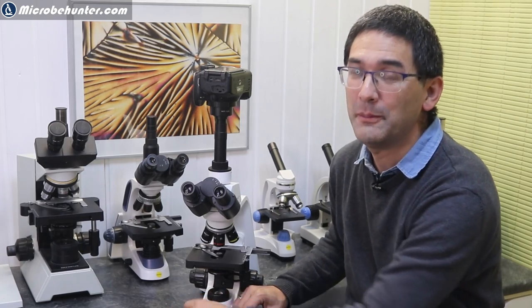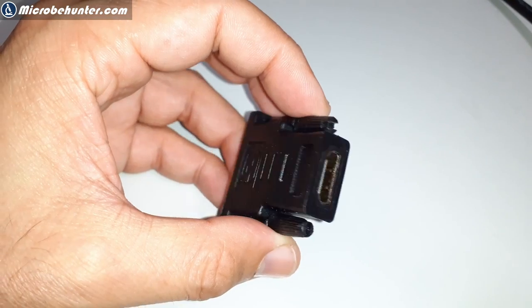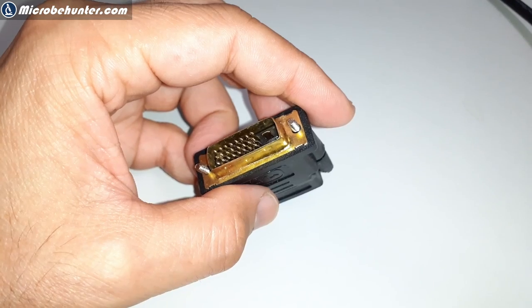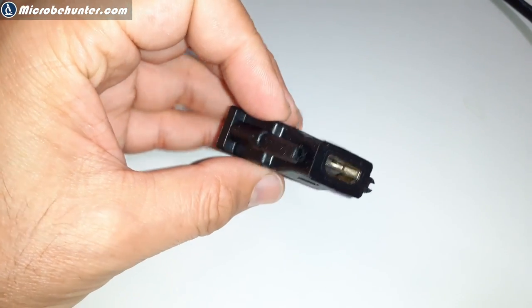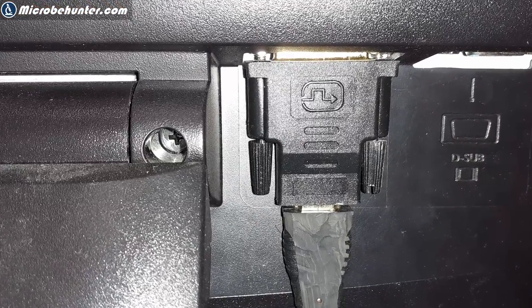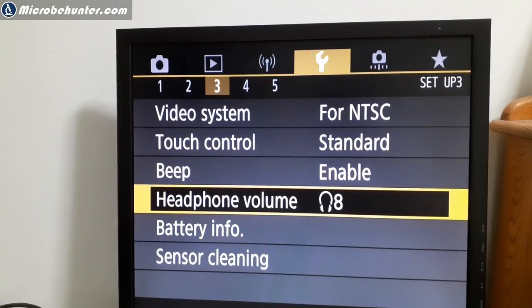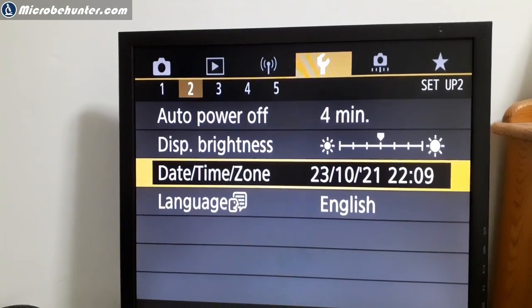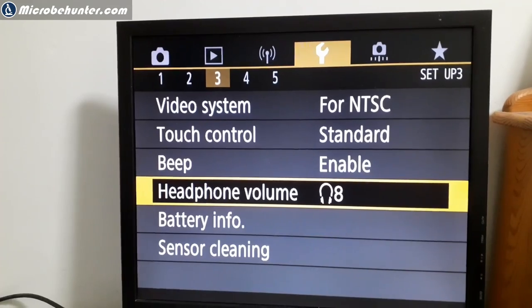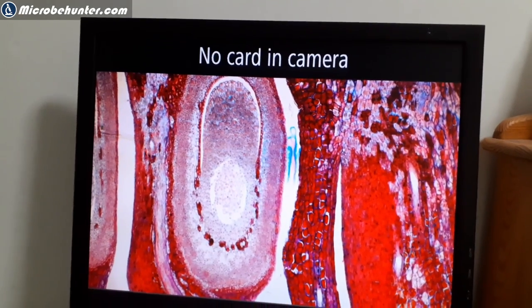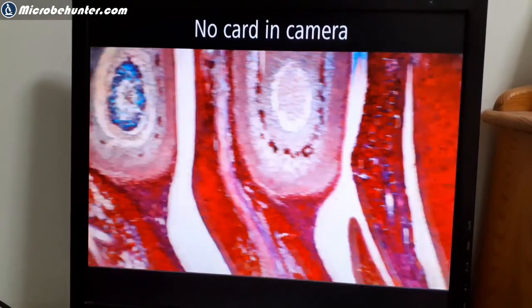Not all monitors have an HDMI connector — especially older monitors. If you have an older monitor without HDMI, don't throw it away; you can get an adapter. This one, for example, is a DVI to HDMI connector — it goes into the monitor's DVI port and has a full-size HDMI connector on the other side. That's actually the system I'm using with an old monitor just to display video from the camera. When I switch on the camera and the monitor, I immediately have a live image on screen without needing to start any computer — it's very convenient for microscopy.